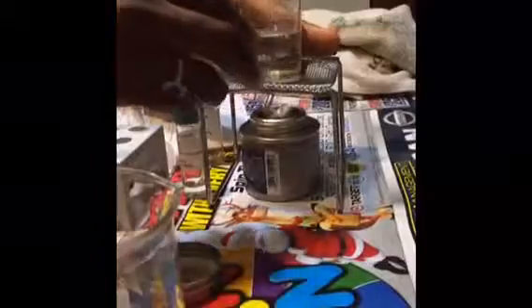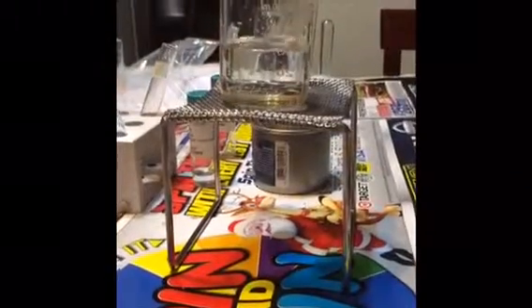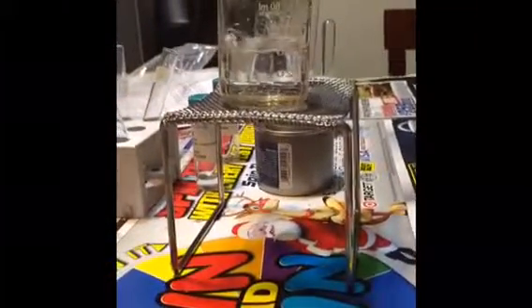Set up a burner. My burner is set. Lighting. Okay. Water is on the fire. My water is boiling. Seems to have overboiled.